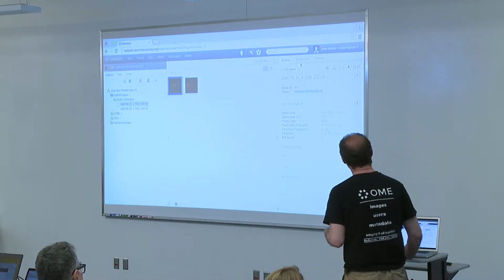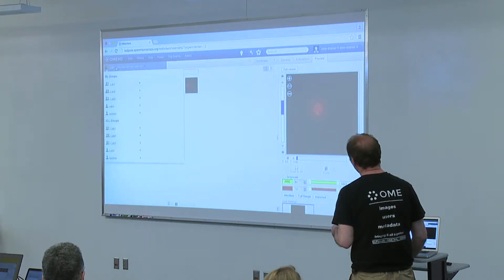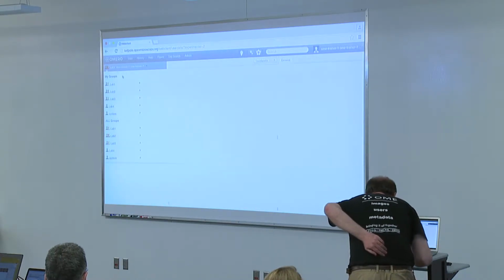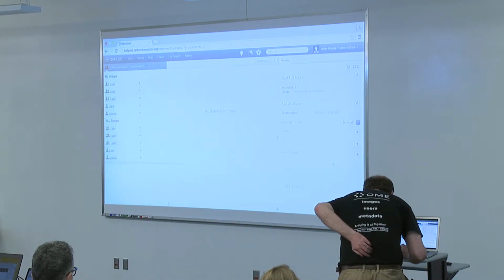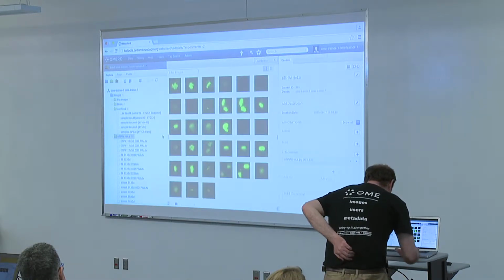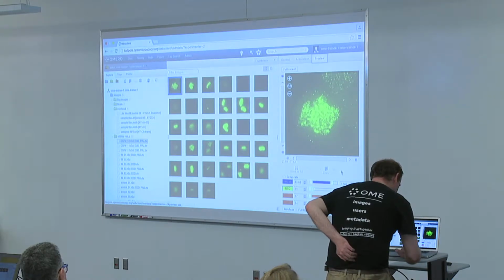I also didn't show one thing. If I go back to my data in the right group, okay. That's better. So I have prepared here the images which I was working on before. Okay.